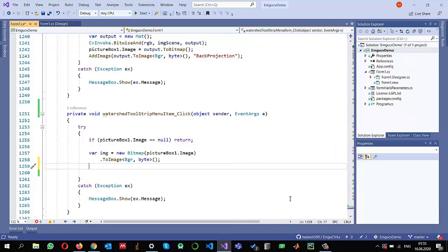I need to calculate the markers, which are basically pixels inside my objects of interest from where the watershed segmentation will start segmenting. I will try to find those areas or pixels inside those objects to use as markers. I'll call this a mask and convert the image to grayscale.